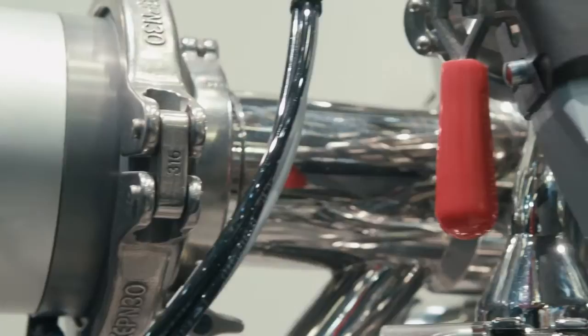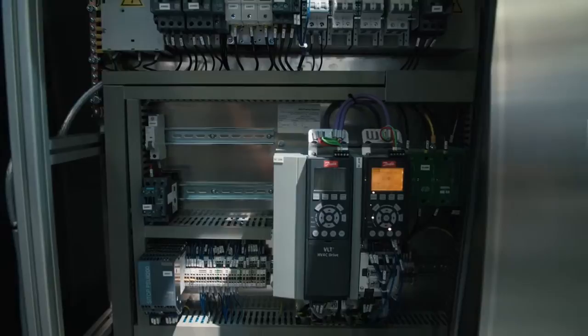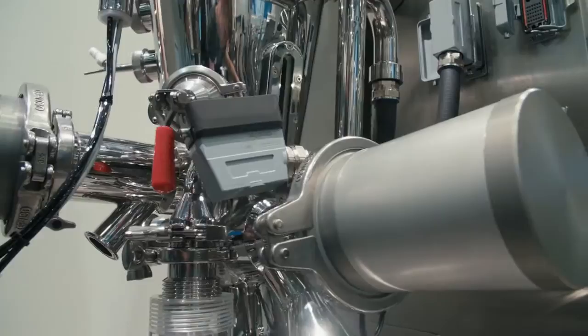We also have the capability of adding our Consigma Coater process for tablet coating processes as well. The really key thing about AirConnect is it gives you the flexibility of running small batches from 100 grams right the way up to 10 kilogram capacity, all from a single piece of laboratory equipment.